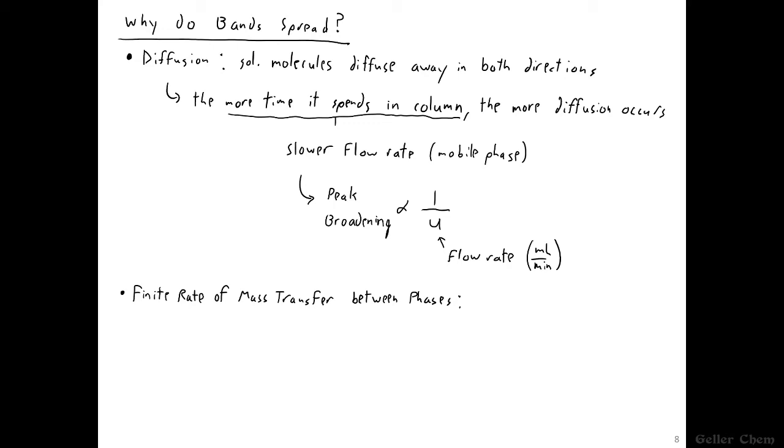We'll just write: solute in better contact with stationary phase lags behind.